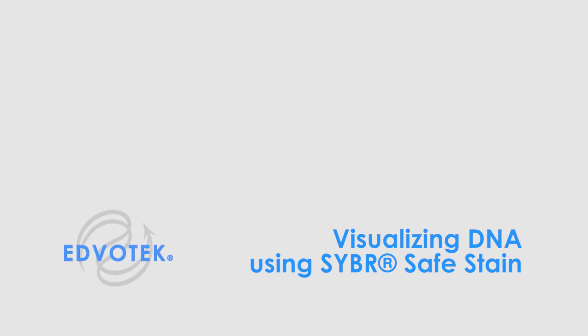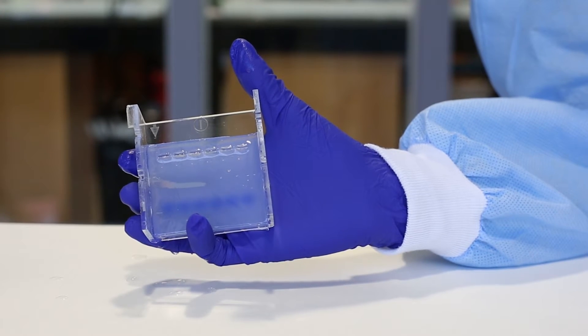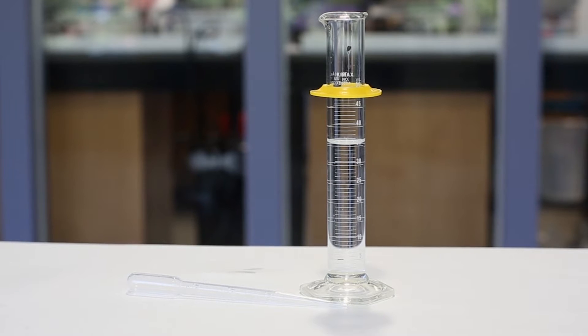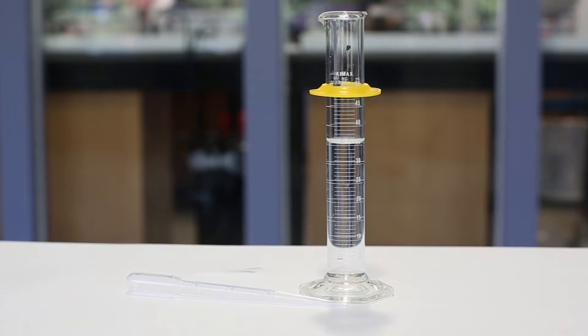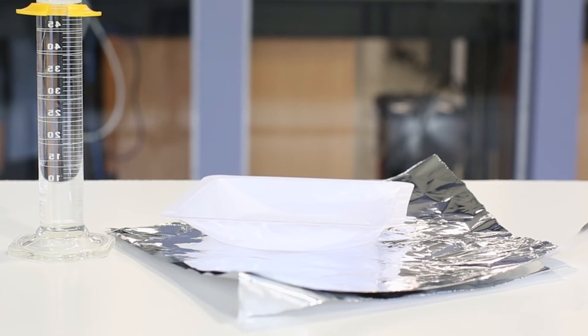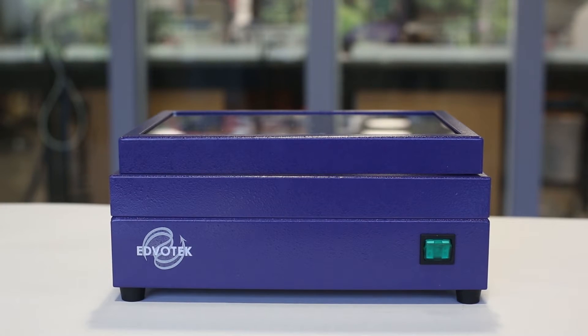Edvotech instructional videos: Visualizing DNA using CyberSafe Stain. For this experiment you will need an agarose gel with DNA samples, concentrated CyberSafe stain, diluted electrophoresis buffer, a small tray or weigh boat, aluminum foil, a micropipette and tips, and finally a UV transilluminator.